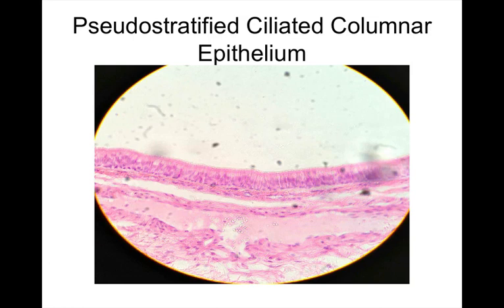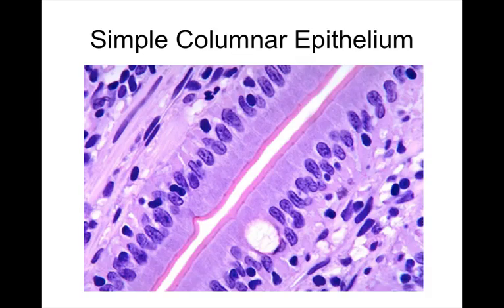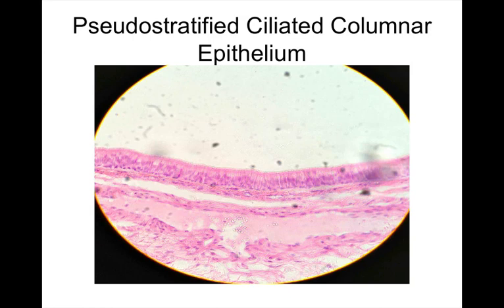All right. Now, this is a slide from the handout, which when we blow it up looks a little bit blurry. But in the case of the pseudostratified ciliated epithelia, here, obviously, one nucleus per cell. Here, it takes a while, but you figure out there's basically one per cell. Here, it just looks like there are tons of nuclei. This is a slightly different magnification, though. And yeah, the cilia look a little bumpy here, but they're also reasonably distinct. All right, cool.